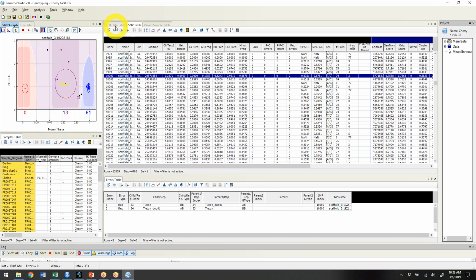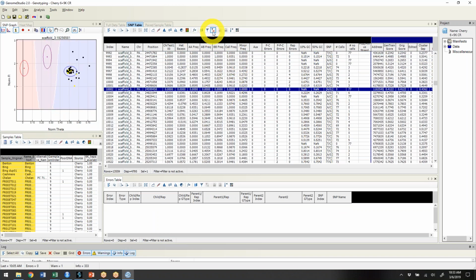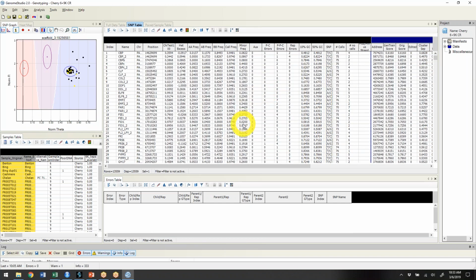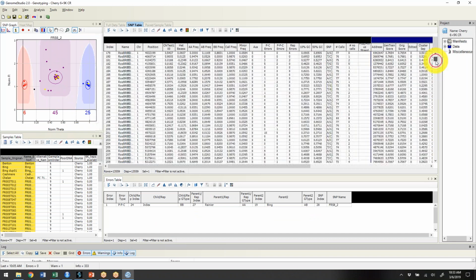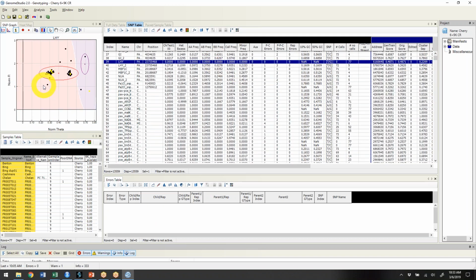And that reminds me of one more thing. Let's say here in the SNP that doesn't have a lot of calls, I'm going to remove the filtering because I think there was one on the top that worked better yesterday. Maybe not. So here I have two clusters, and they're both in the AA realm.